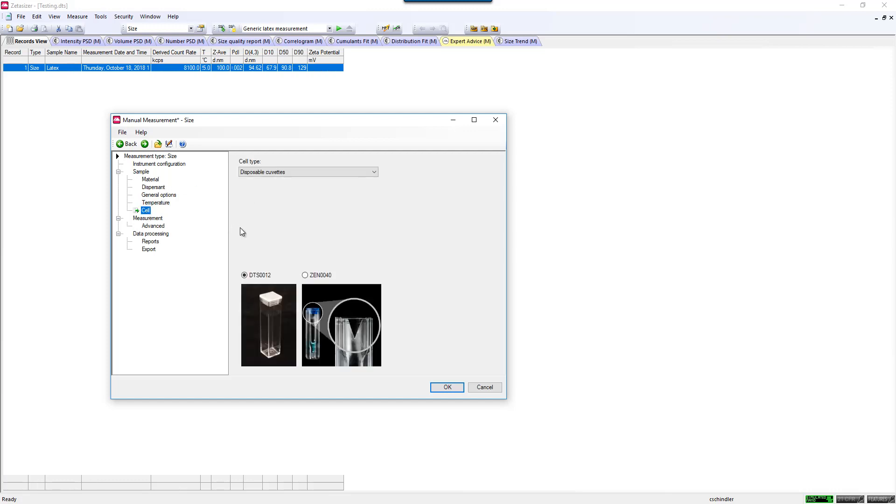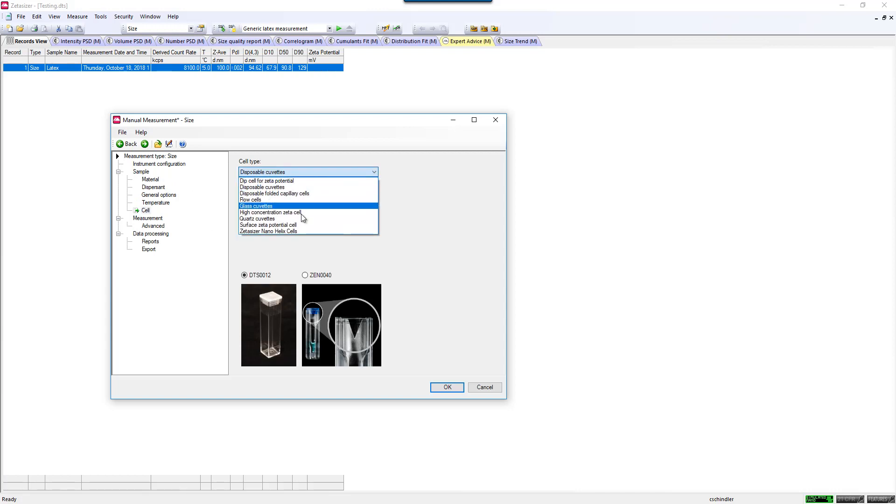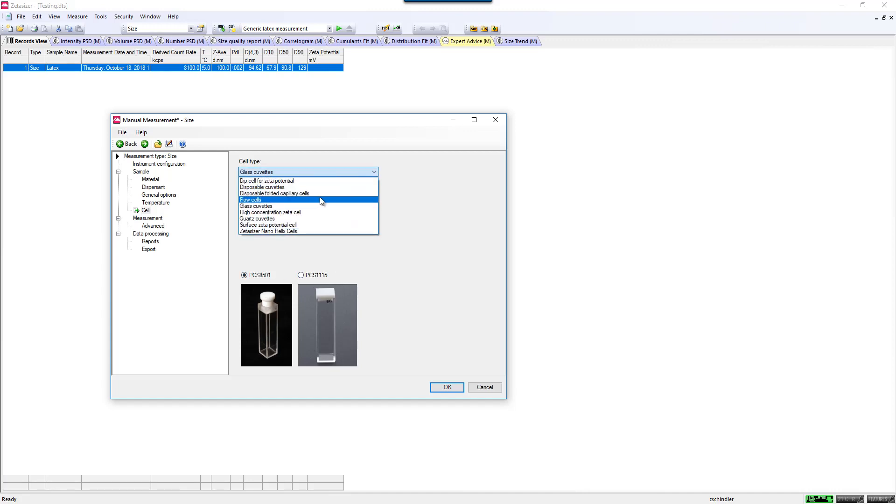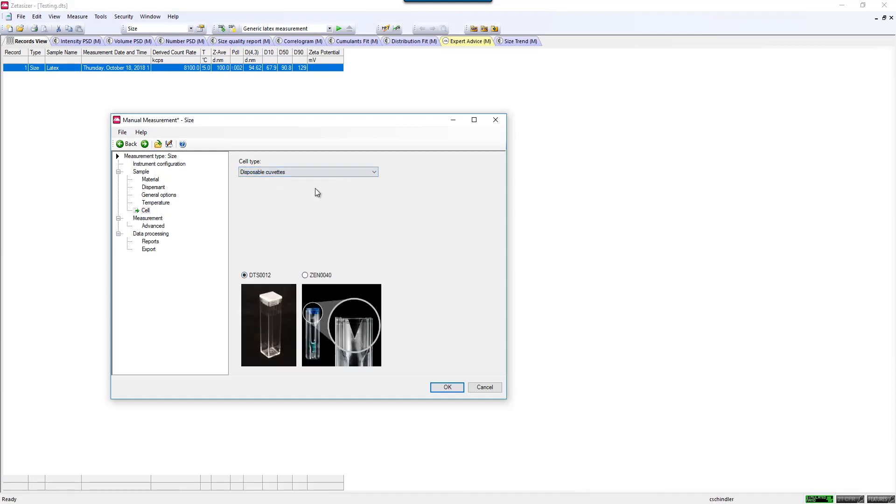Another critical component is the cell. There are different types of cells that you could use for sizing, and all of those are listed here. If you click on some different ones, you can see pictures of them and the part numbers in case you will need to order additional cells, or just to verify that you're using the exact cell that's pictured. This is one of the standard sizing cuvettes that's polystyrene.